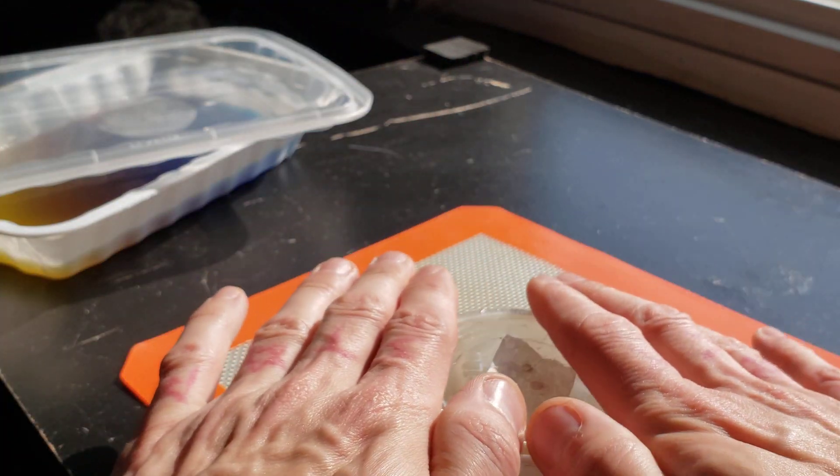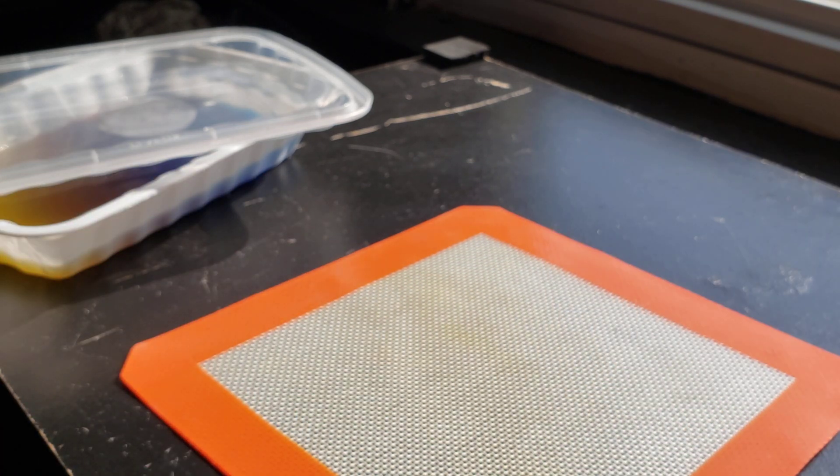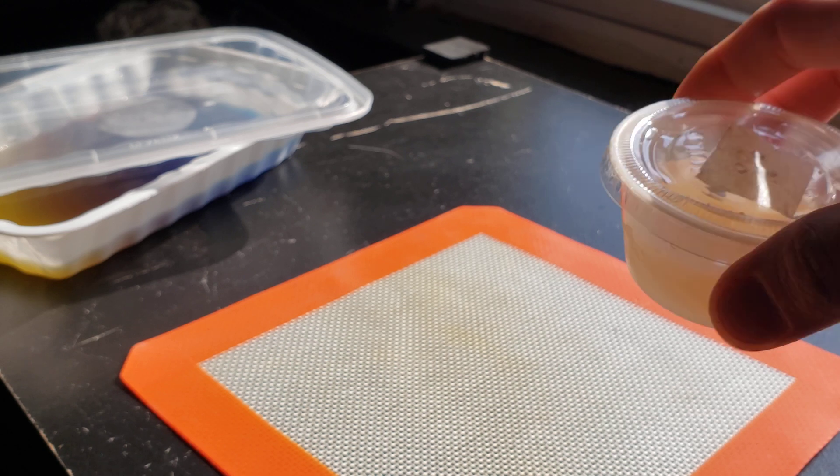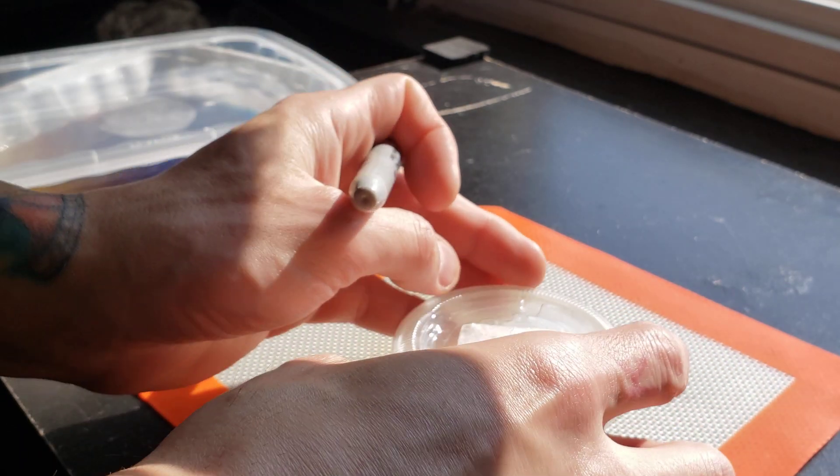I'm just going to go ahead and close it up and leave it out here at room temperature, not in the sun. I should add the date to that too — this is our July 4th clone.